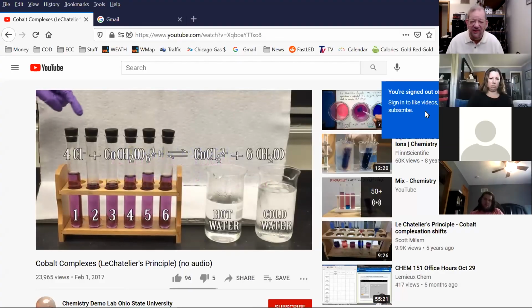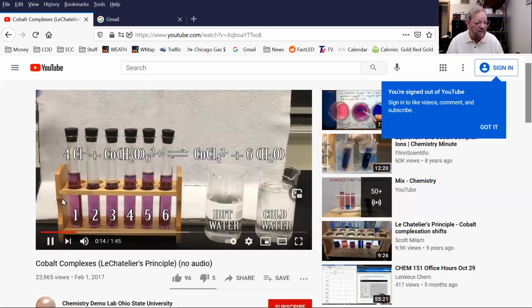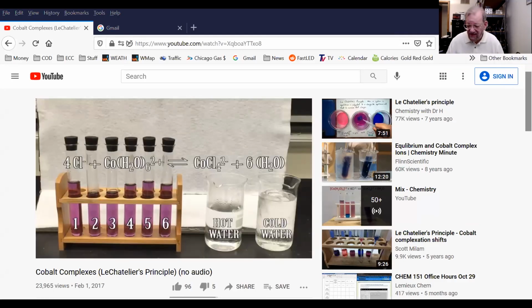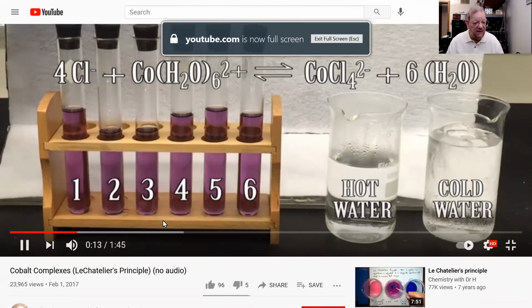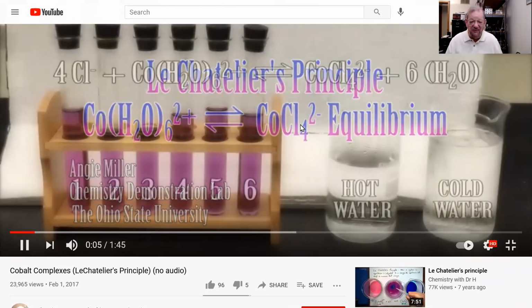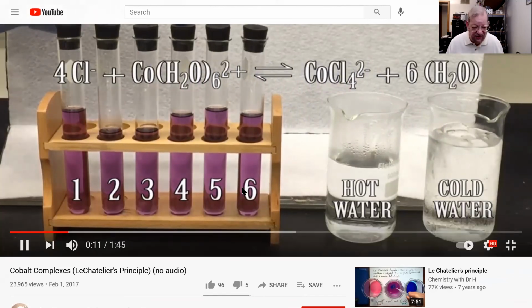Everybody see YouTube on your screen? Thank you. All right, if you notice, they're doing the same equilibrium we have, the same reaction, and they already have this equilibrium in these 6 test tubes.